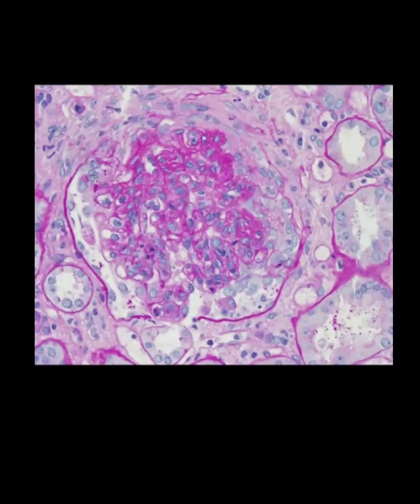This is the most important stain in nephropathology. If an examiner asks me which stain I love in nephrology, my answer will be the periodic acid Schiff, because it has a beautiful magenta color and it will highlight the carbohydrate-rich structures, and you all are aware that any basement membrane is made up of carbohydrates as well as proteins. So it highlights the GBM very beautifully, the mesangial matrix, and the proximal tubule brush border. So virtually any structure looks very beautiful in a magenta or pink-purple color in case of periodic acid Schiff.